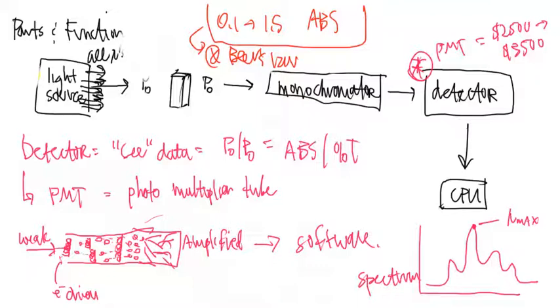Lower than 0.1 is typically an area where the samples are so weak it can't tell if it's absorbing or not. And higher than 1.5, the samples are too concentrated, so it can't tell the difference between how one super concentrated sample absorbs and how another does.